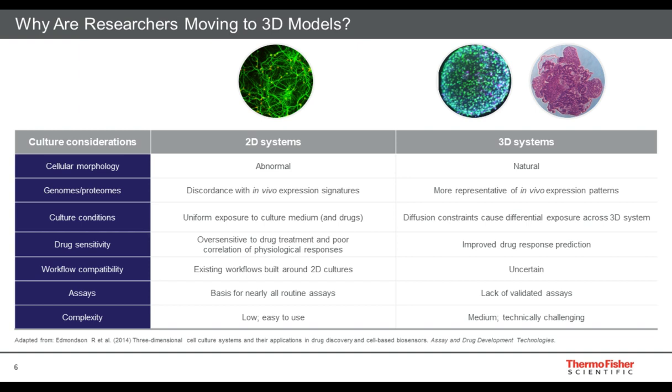And so with these 3D model systems, some of the interest in driving researchers towards 3D models is to overcome that limitation of 2D models and put cells in a context where they can interact with other cells in all dimensions and interact with different cell types in a spatially important way, where different cell types are arranged similarly to the way in which they might be in vivo.